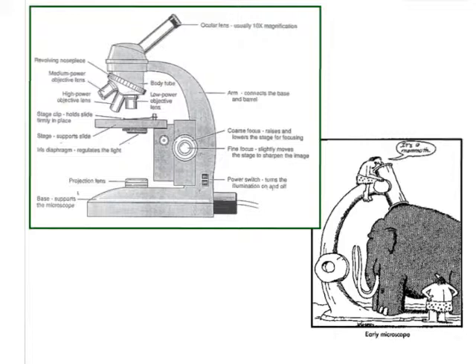The slides as well, they're made of glass, so they are breakable, and we just need to be very careful when we're using them. Hopefully you've enjoyed a couple of the cartoons. Tried to make this a little bit exciting because it's a little bit dry with just labeling parts of the microscope.